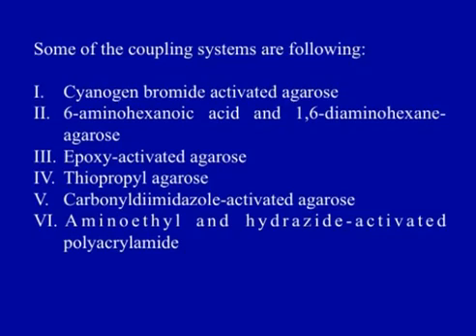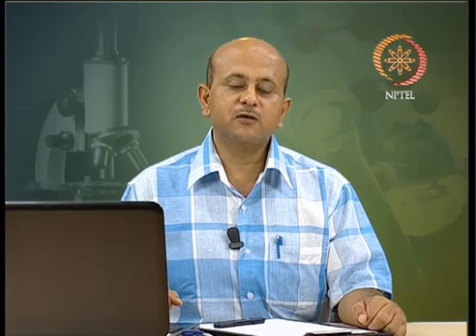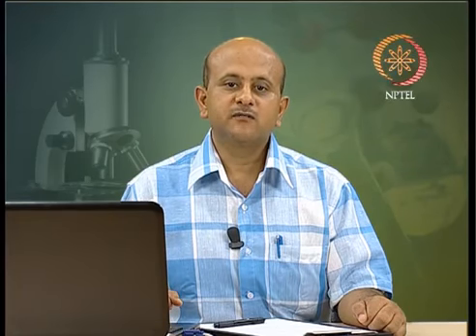Carbonyl diimidazole activated agarose could be utilized in place of CNBr coupling. Many times in CNBr or cyanogen bromide coupling, the nucleophile reacts with the cyanate ester of CNBr, resulting in an isourea linkage that carries a potential charge and can act as an ion exchanger, and thus in affinity chromatography the specificity is decreased.